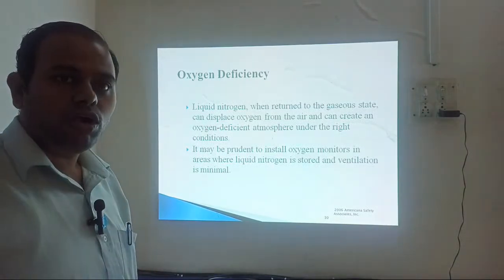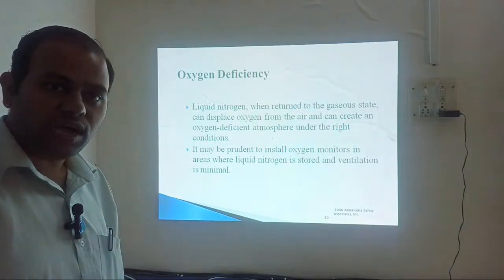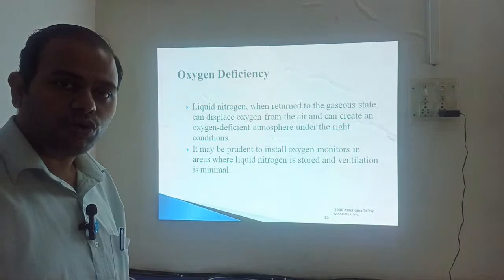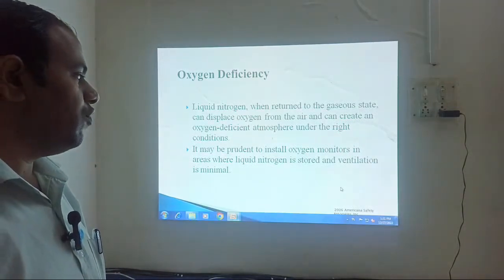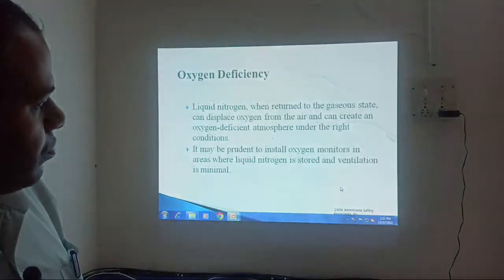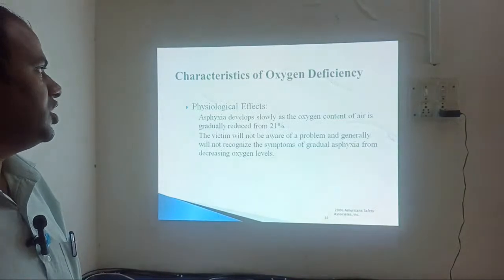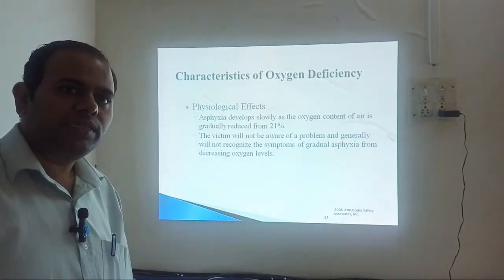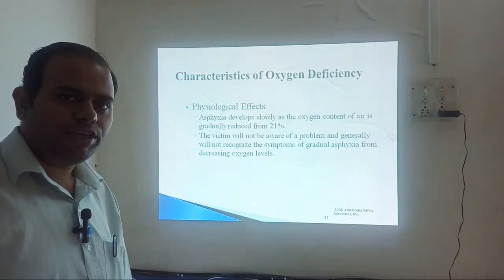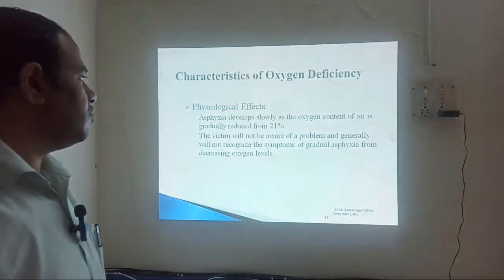So you will not be able to find out that oxygen deficiency is occurring in that particular area where liquid nitrogen is stored, but you should know that it causes oxygen deficient conditions. So, characteristics of oxygen deficiency: if you are working in a liquid nitrogen atmosphere, how will you know that an oxygen deficient condition has formed or not?